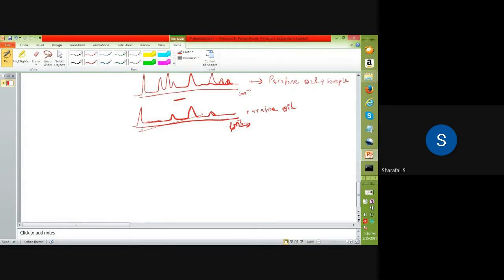Okay, so the computer knows the paraffin oil spectrum. If you already know the paraffin oil spectrum and feed it into the computer system, then the computer knows, for each wave number, the intensity corresponding to the paraffin oil. The computer also has the data for the paraffin oil plus your sample, which is stored, converted into the frequency domain, and then converted into wave number, like in the first figure.